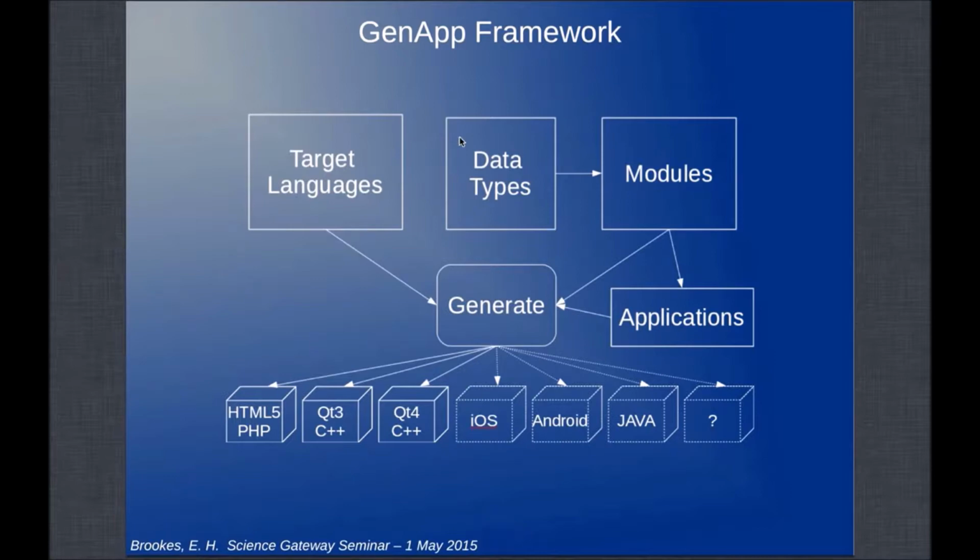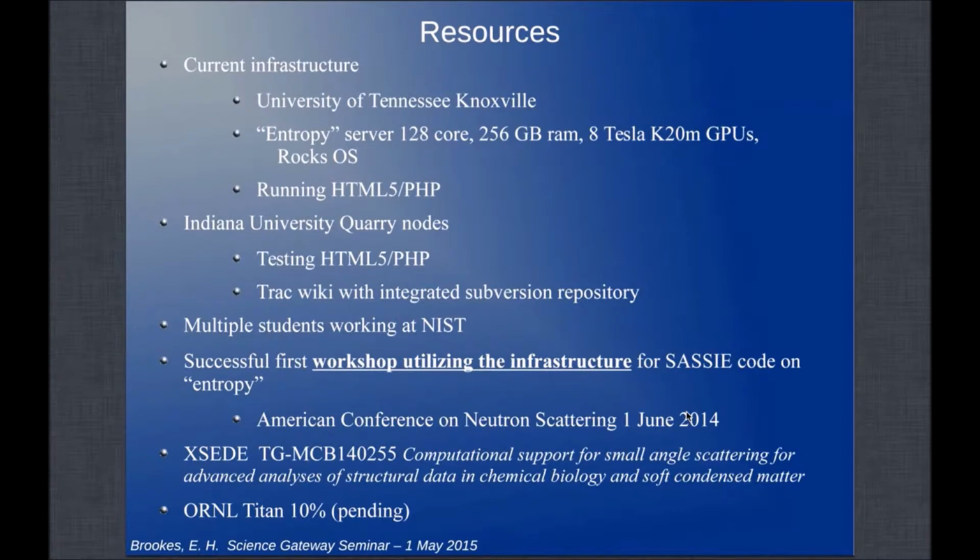File management. I'm going to talk about that for a minute. So ideally, everything should come in and out of the JSON, but that wasn't practical in the SAXS case because they had a lot of dependencies in their code that required the structure of having some directory created and files existing for the next step. I'd like to see it all coming in and out of JSON, so that workflows could easily be defined on this at some point.